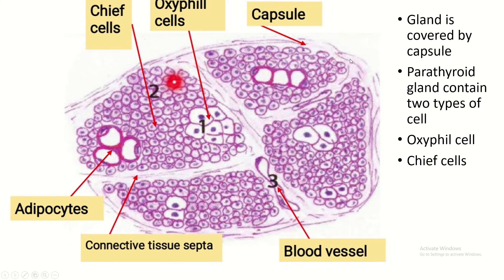The gland is covered by the connective tissue capsule. This is the connective tissue septa. The parenchyma of the gland contains two types of cells: the chief cell and the oxyphil cells, and occasional adipocytes and blood vessels present within the gland.